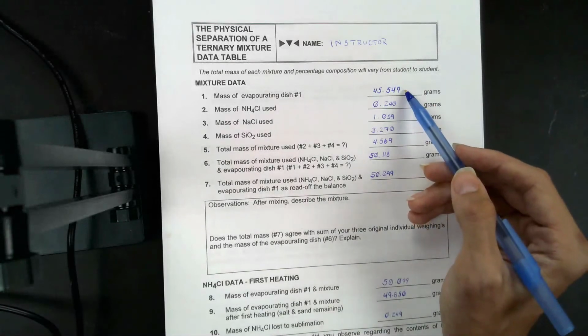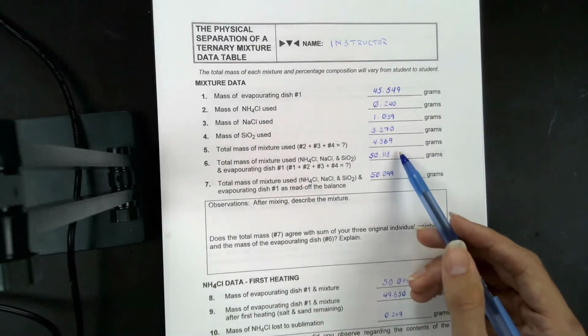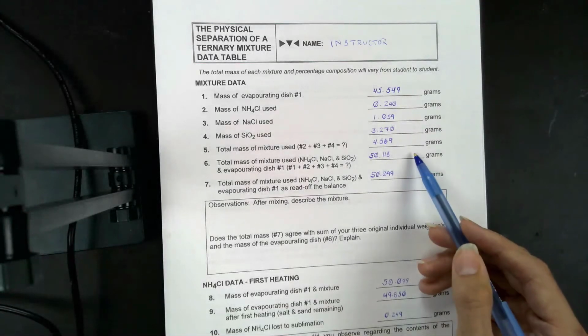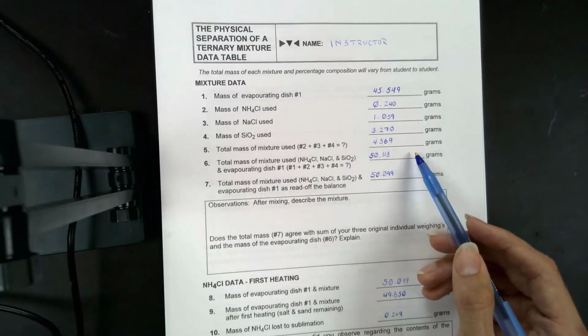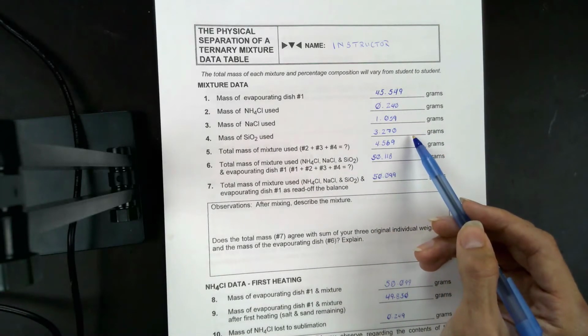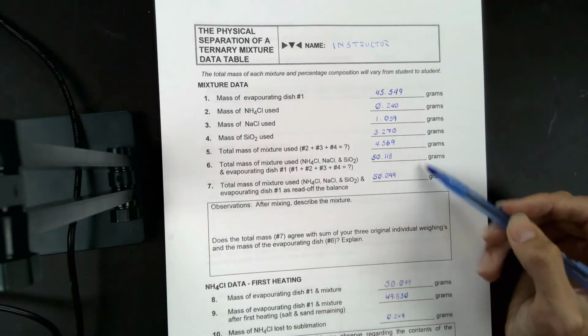So here's just the mass of the evaporating dish. This is the mass of the evaporating dish with everything in it. And if you notice, 6 and 7 theoretically should be the same, right? Because that's what 6 is as well. 6 is the mass of the mixture used, so it's all three of my components, plus the mass of the evaporating dish. But you'll notice that they don't match.